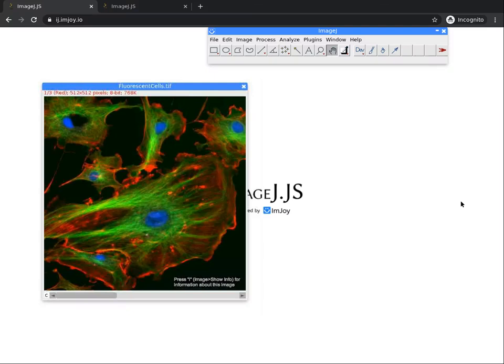Welcome back! Now that you have discovered how to modify your images to be able to process them, you will analyze the main images and discover the possible tools offered by ImageJ. First of all, we will discover a very interesting tool displayed by ImageJ, which allows you to calculate many aspects and details of objects in an image.